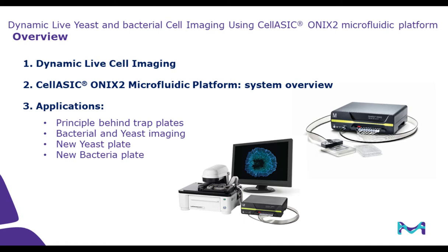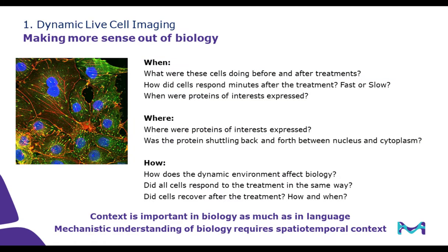And here's just an overview of what we're going to cover today. First, we're going to talk about why it is important to do live cell imaging. Then I'll introduce the microfluidic platform and how we use it. Lastly, we're going to talk about the applications and what types of experiments you can perform using the system.